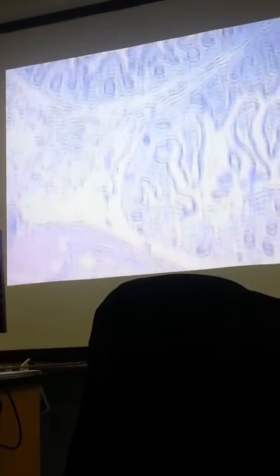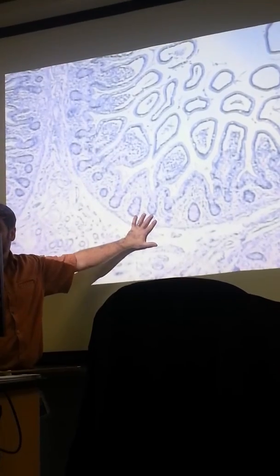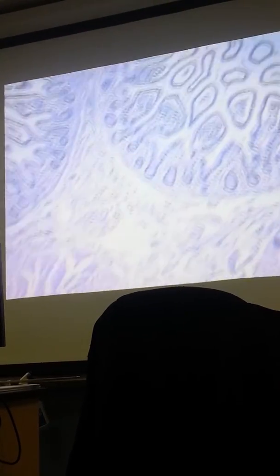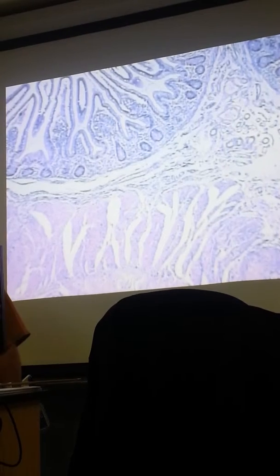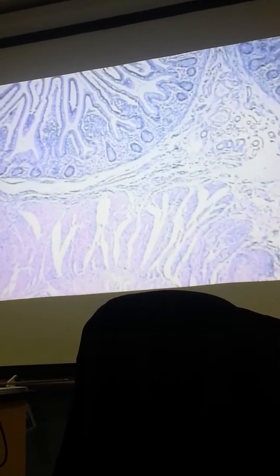Not seeing any Peyer's patches yet. You remember the ones that had the Peyer's patch? It was like right down here. Mm-hmm. So I don't see any on this one. But remember that we thought that the jejunum had a lot of Peyer's patches, right? Yes. Now, in reality, that's not where you find the most Peyer's patches in the real world.